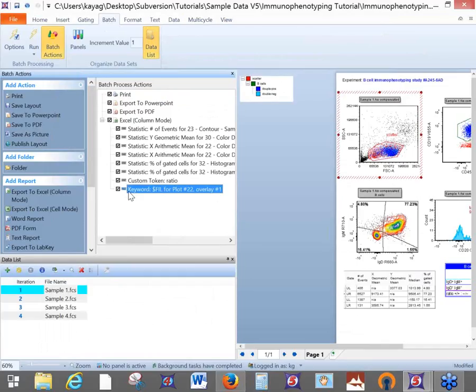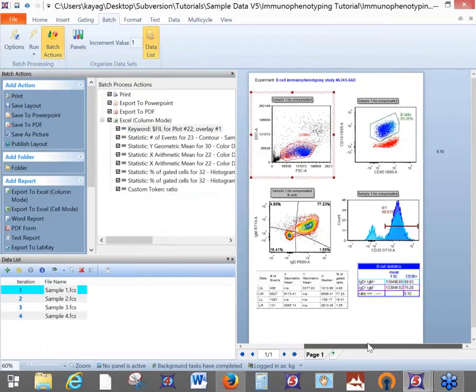I see keyword is now last in my list, and if I were to export this, that would be basically the last column in my Excel, but I really want that descriptor to be column A in my Excel. So I'll just drag this up here, and now that's going to be my first column in my export. Does anybody have any questions?